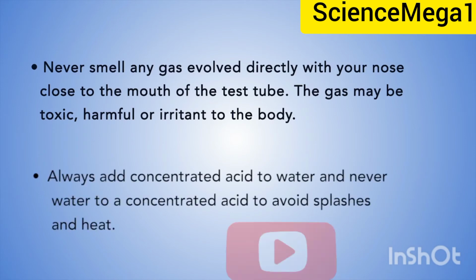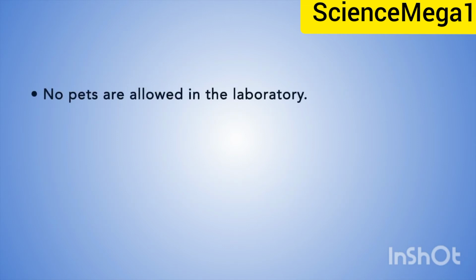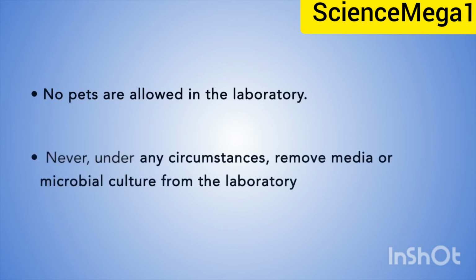6. Always add concentrated acid to water. Never add water to the concentrated acid, to avoid splashes and heat. 7. No pets are allowed in the laboratory. 8. Never, under any circumstance, remove media or microbial culture from the laboratory.